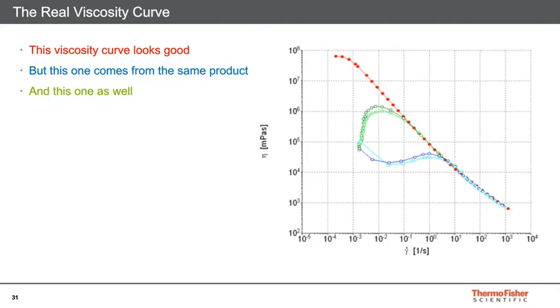And the same material again is interrogated here, now shown in green, and we see a third response where we actually see an increase in viscosity, then a decrease, and eventually see an overlap with the red data. So really the difference, we're seeing identical material, but the difference is actually how the method was defined and how it was used for these materials.